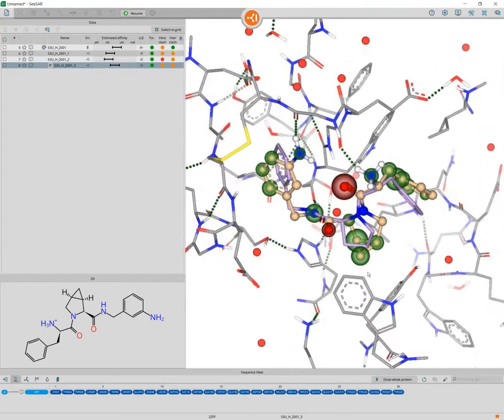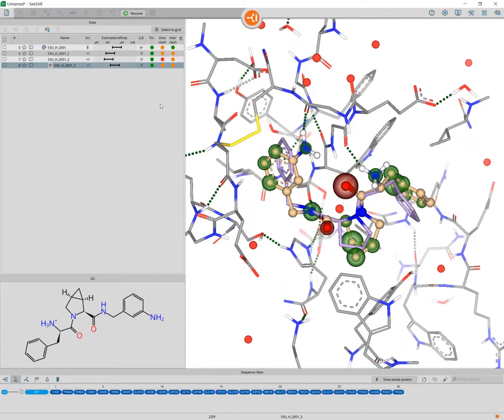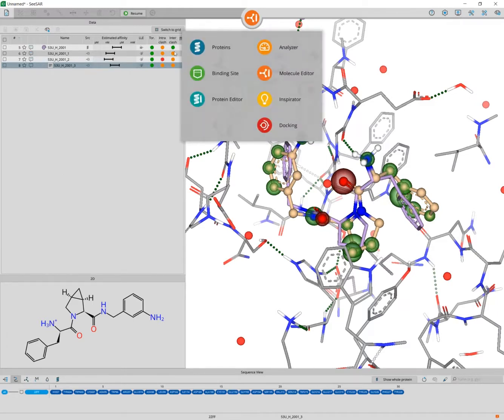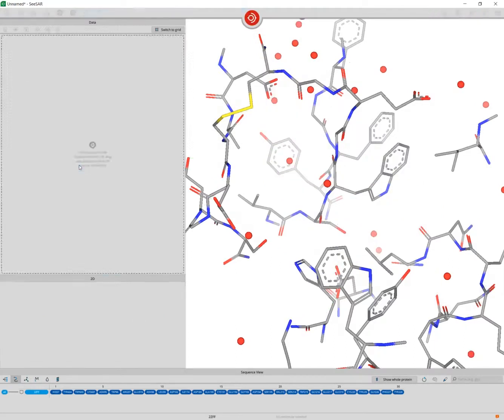So you see how this is a little bit of playing backwards and forwards, and I ran now into a situation where the molecule might be of my interest, but I have moved it to a position where it's a little bit unlucky. So let's try to find a position for this molecule which is still able to form an H bond here. And to do so, we have to start a docking, and docking happens in the docking mode. And as I want to dock this particular molecule, I will click on the row menu again and add this molecule to the docking mode.